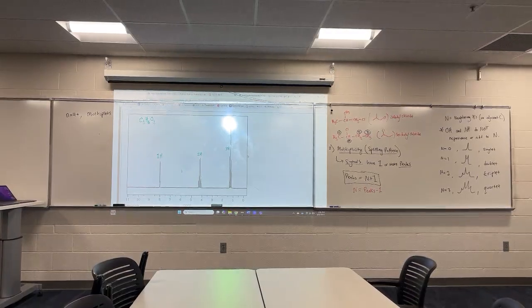Do you want to move closer? What do you want? The numbers on the bottom? Or the number of lines? I agree. 2H? I'd say 4 as well. Looks like a quartet. 3H? Sure.